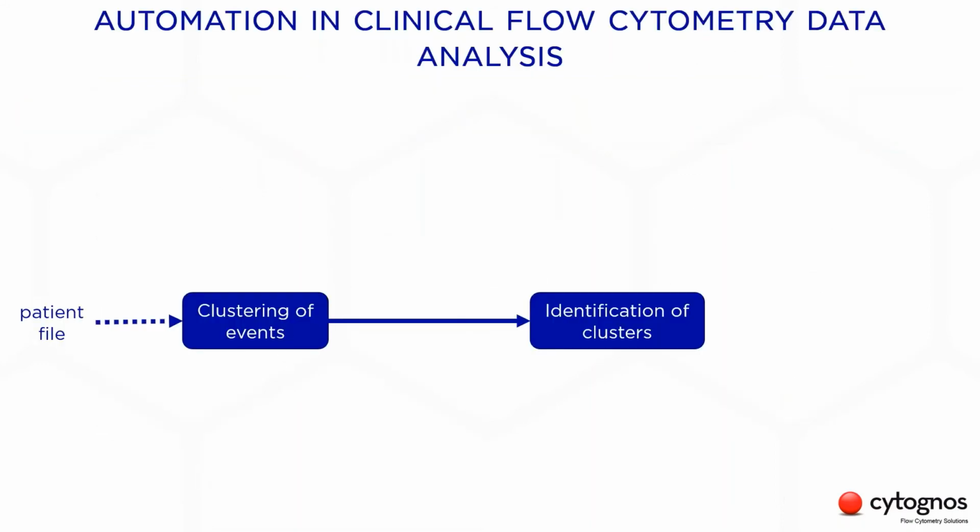Okay, still the problem in flow cytometry analysis is the lack of a good reference point or baseline. And as complexity of flow panels and data analysis increases, we really need big data analysis approaches. So we need automation for our clinical flow analysis.